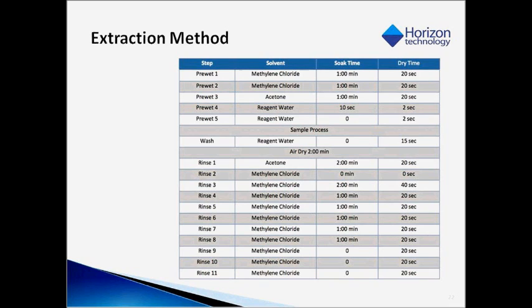The sample flows in another cycle from the original sample bottle into the disk holder very quickly, and then directly flows to the water waste. The PAHs are actually retained onto the DVB disk. The sample bottle is rinsed with the solvent also used for elution.